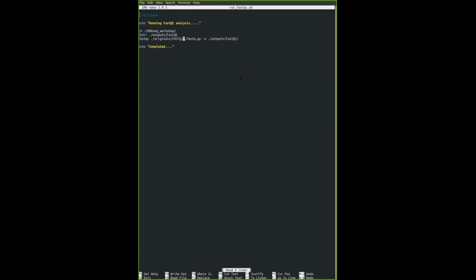No worries. Can you copy paste that in? I did. I already did. So for those who are having problems with this, you can go to Etherpad and copy the entire code. Again, this assumes that your directory is in home.